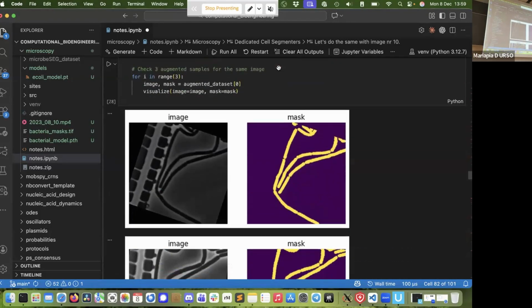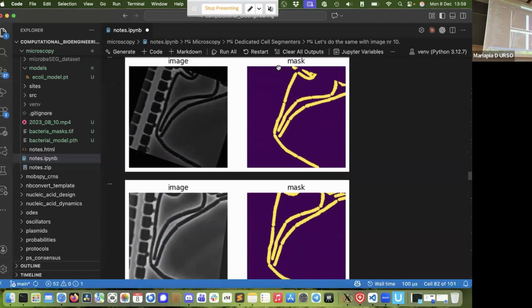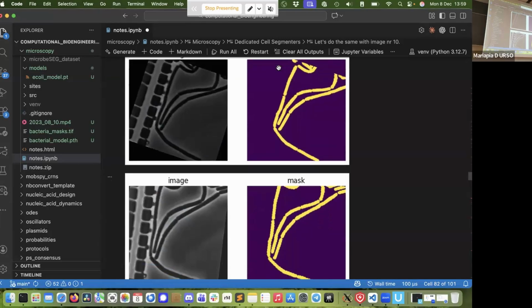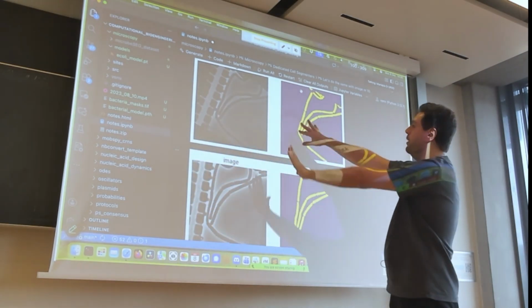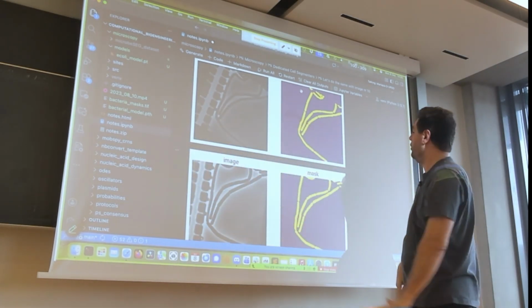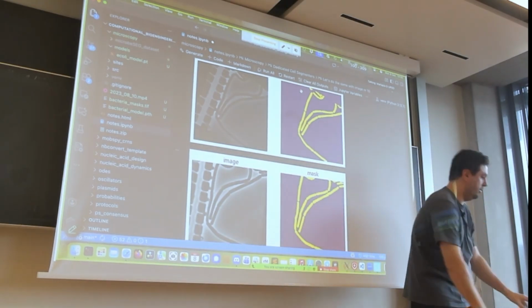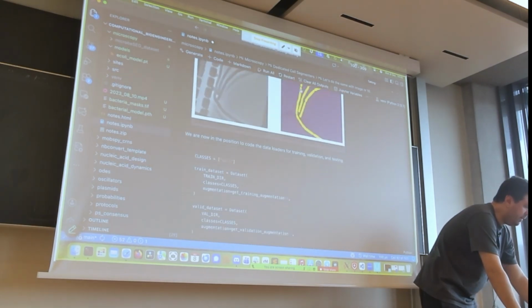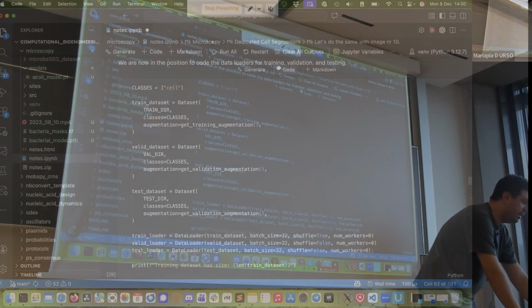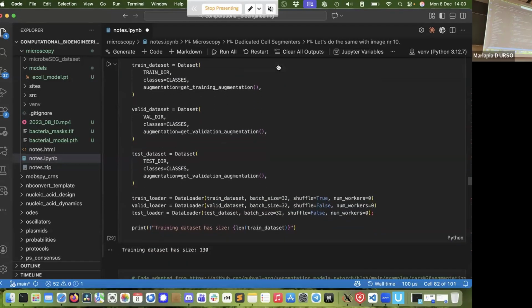And that's after augmentation. Augmenting the same image, we get, for example, these instances. So you see here it has been turned a bit and made a bit darker. Here it has been cropped, I think, and so on. We get tons and tons of images suddenly. This is just creating the datasets with these augmentations.